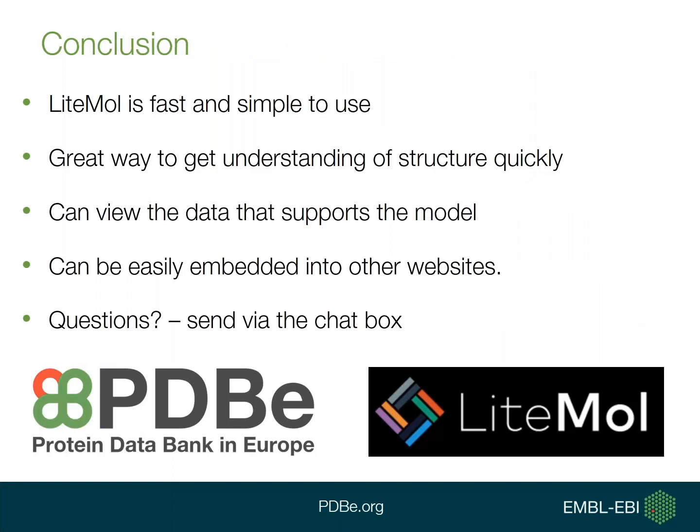So in conclusion to this webinar, LiteMol is fast, and it's hopefully a very simple to use browser visualization tool within your browser. We think that it's a great way to get a chance to understand the structure quickly without needing to go too in depth, without having to download the files and view it that way. Another bonus is the option to view the data that supports the model, and this gives you more of a chance to validate what you're seeing. It can also be easily embedded into other websites if you want to use it for your own purposes.